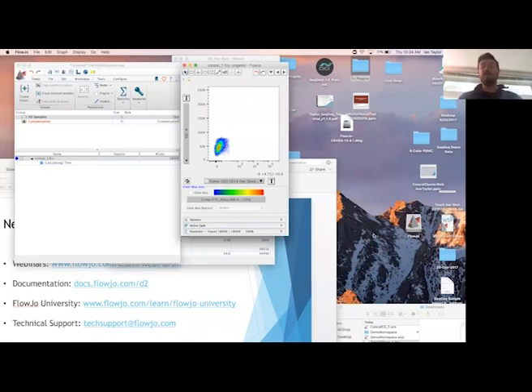In fact, if we had 20 markers and many more events, we might have wanted to drill down to something very specific, and then you could run tSNE on whatever parameters were left. But you typically wouldn't want to run tSNE on parameters that you've already used for gating, because you've already gleaned the information that you're interested in from those parameters. And so that's why I excluded CD3, because we already know that the populations that we combined are our CD3 positive T cells. So absolutely.